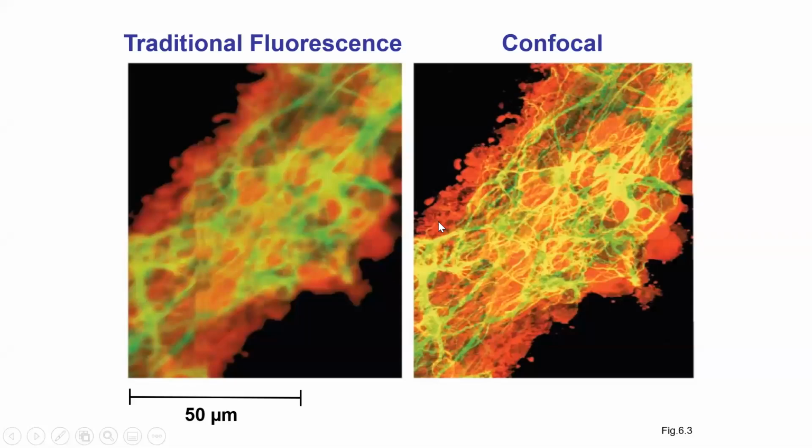So I just want to talk about confocal microscopy for a moment. A lot of fluorescence now, for at least research, is moving towards this confocal microscopy. That's using the lasers. So why are we doing that? It looks like we're getting a better image.